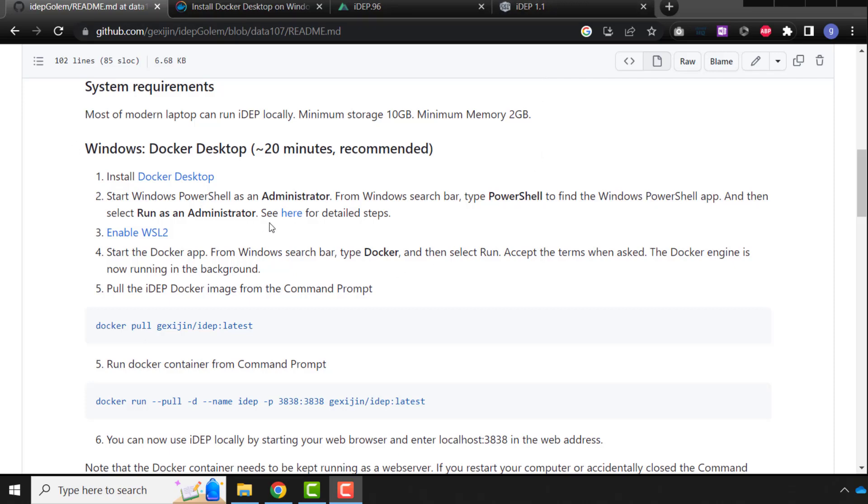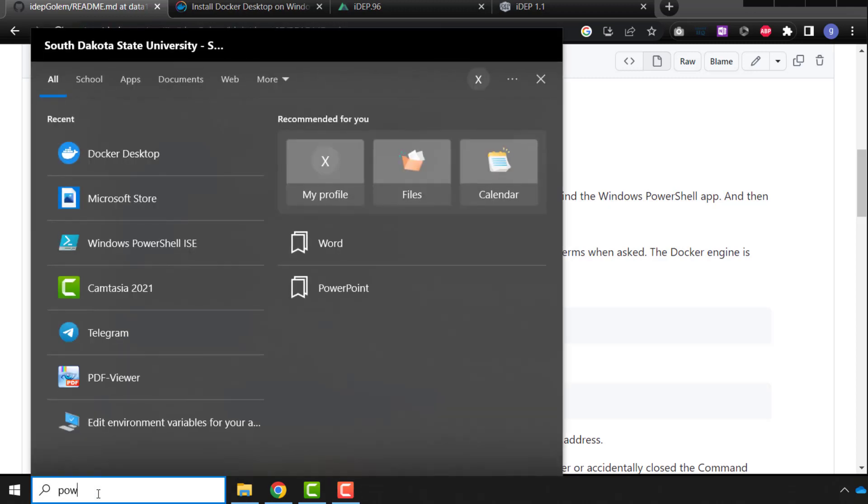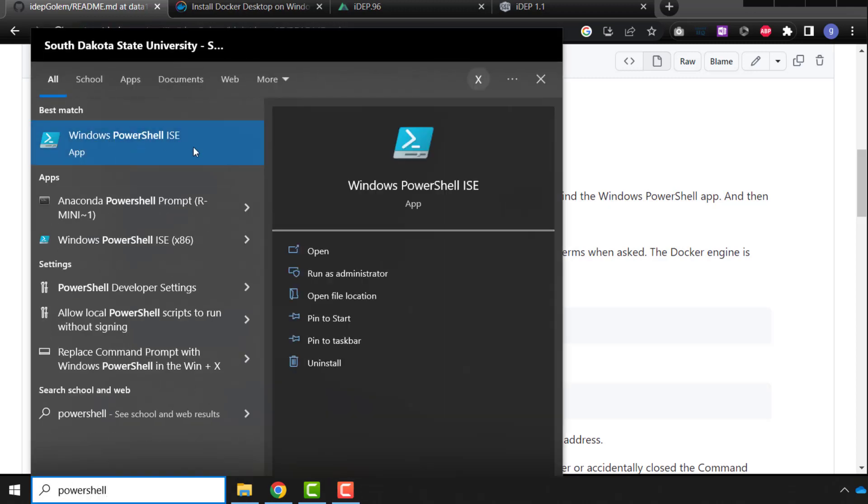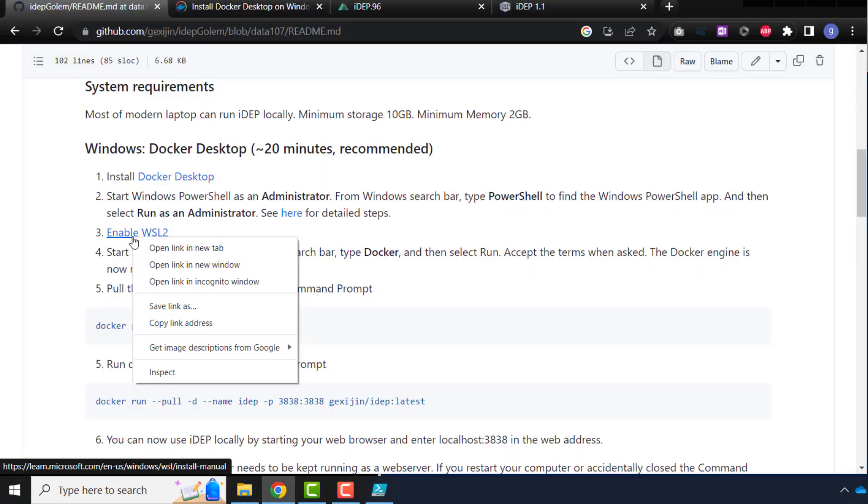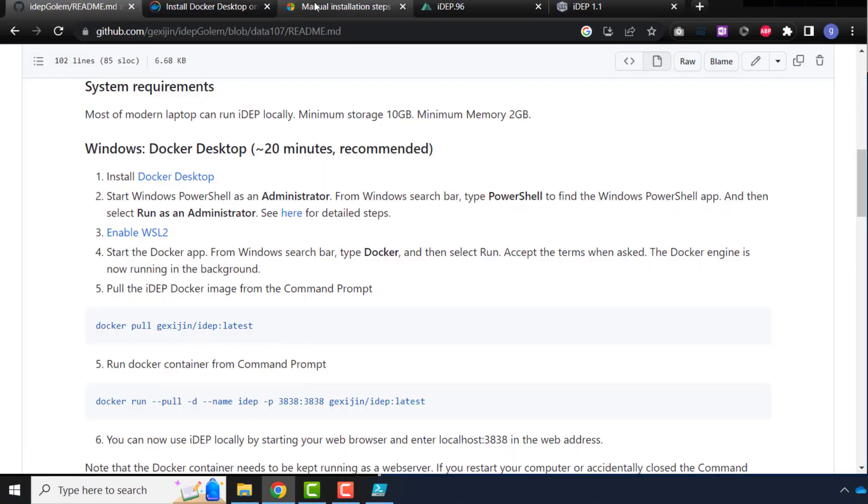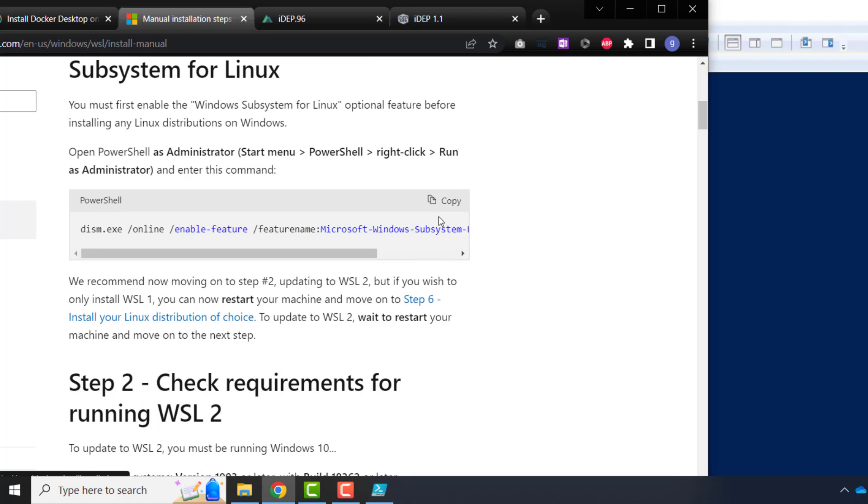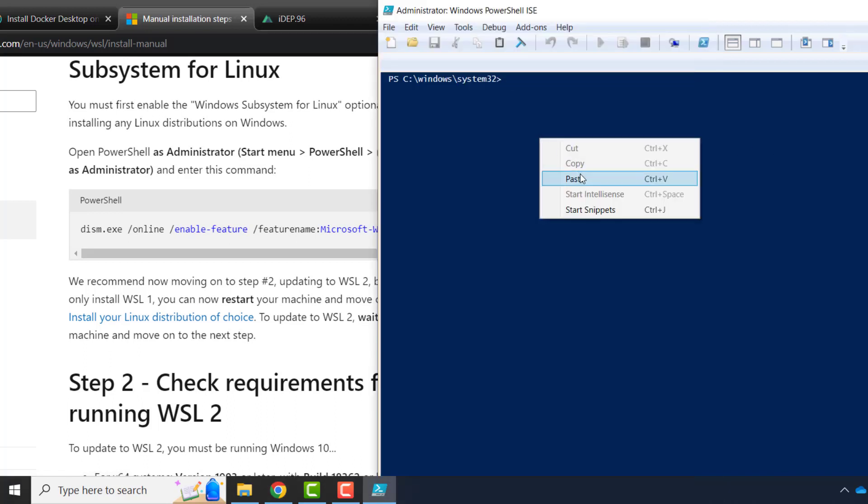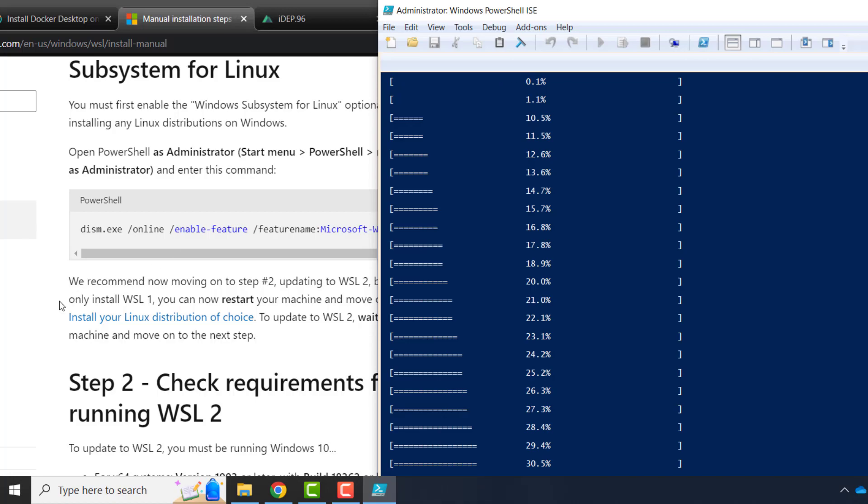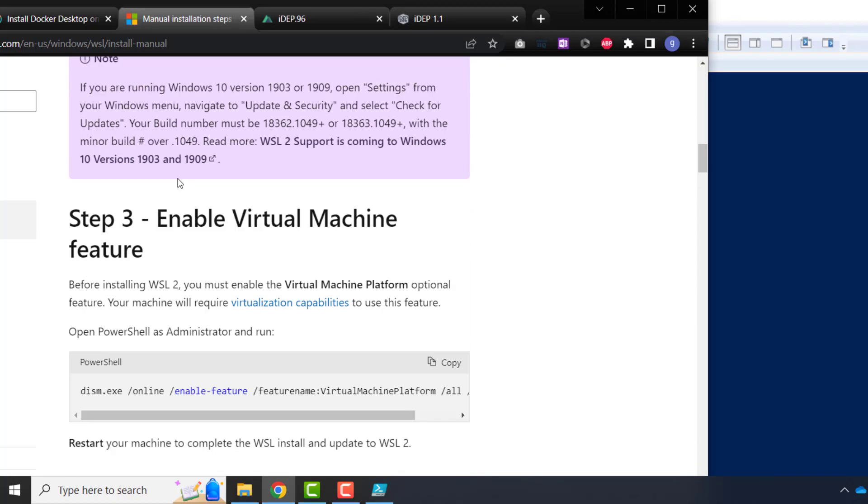Okay, the second step, we are going to start Windows PowerShell as an administrator. So we type here, PowerShell, and run as administrator. This is important, so run as administrator. So we have a PowerShell window showed up. Windows subsystem for Linux. So open this in a new tab, follow these steps, copy this code, come here, paste, run, finished. Check if we have the requirements, I think we are fine.